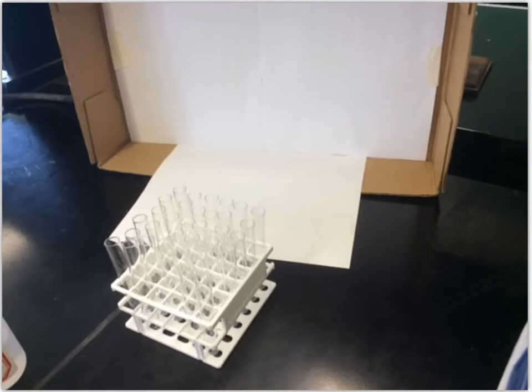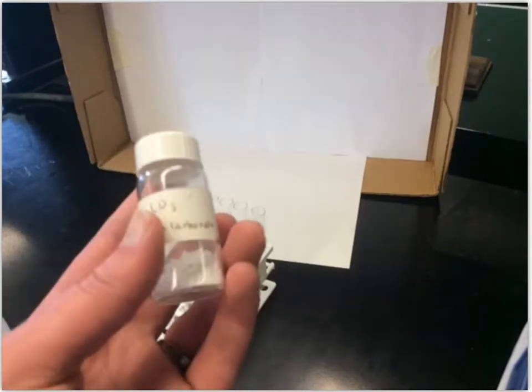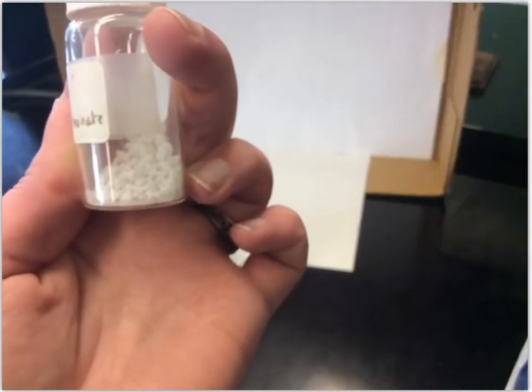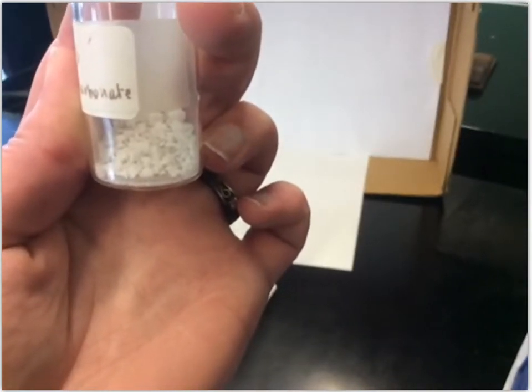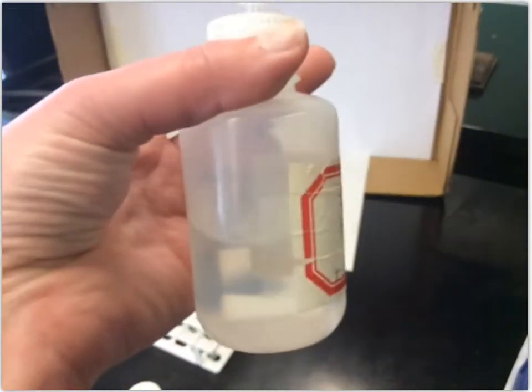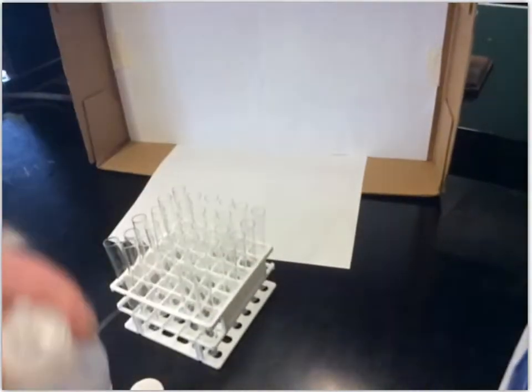The second reaction we're going to perform is between calcium carbonate and hydrochloric acid. I have a sample of calcium carbonate here — you can see it looks like just a bunch of little white rocks. The hydrochloric acid is just this clear solution.